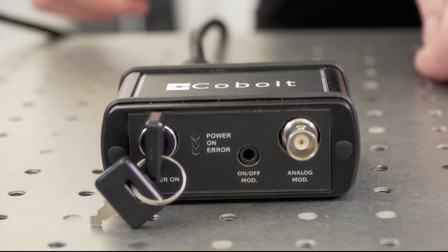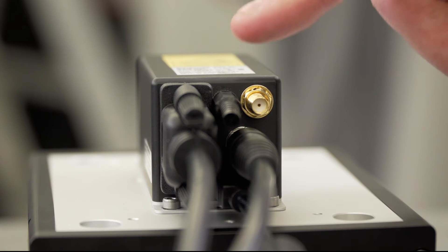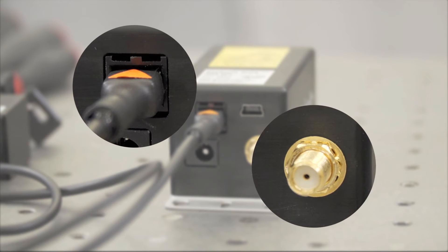The 06-MLD key box also features input connectors for analog and on-off modulation signals. The digital modulation signal is fed directly into the laser head. The 06-DPL has slightly different connectors, still with both analog and digital modulation capabilities.